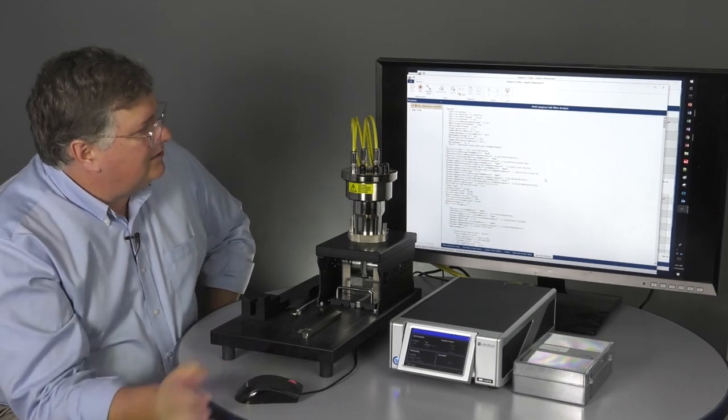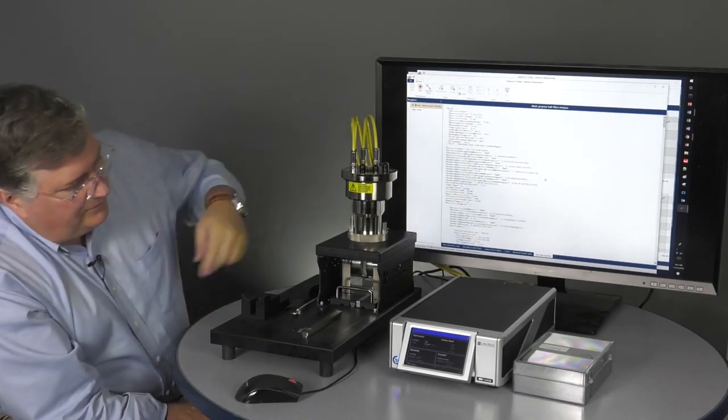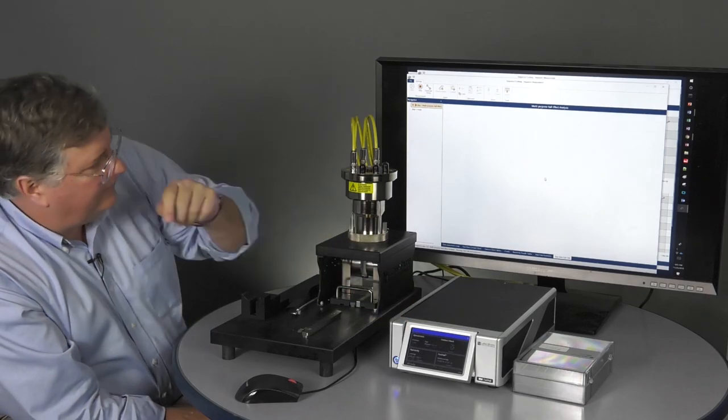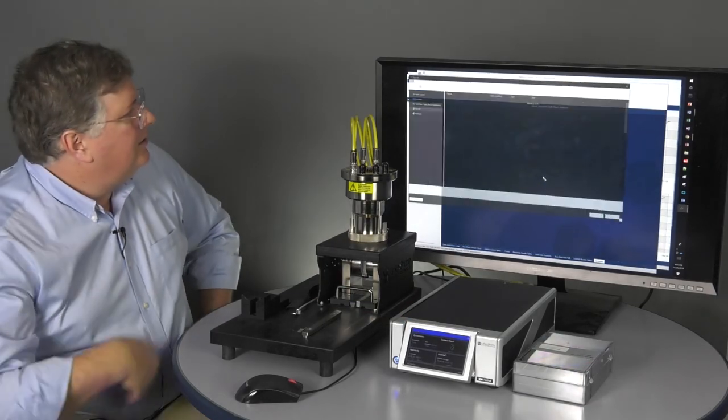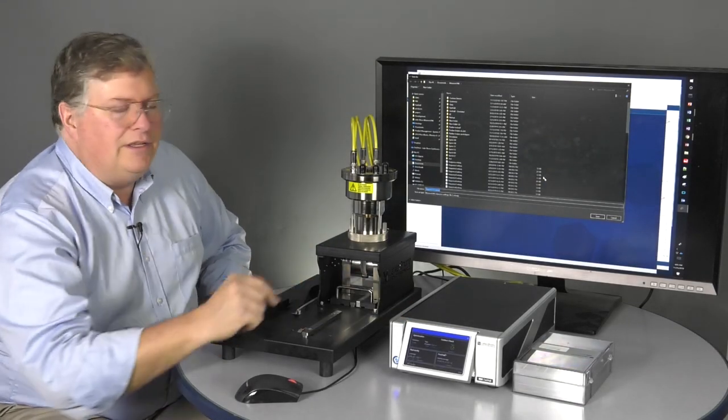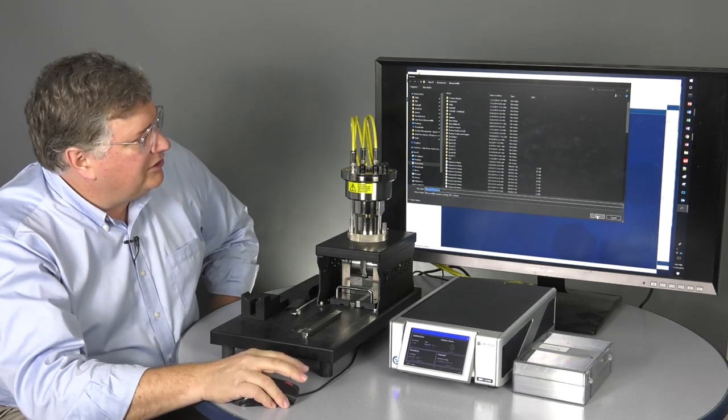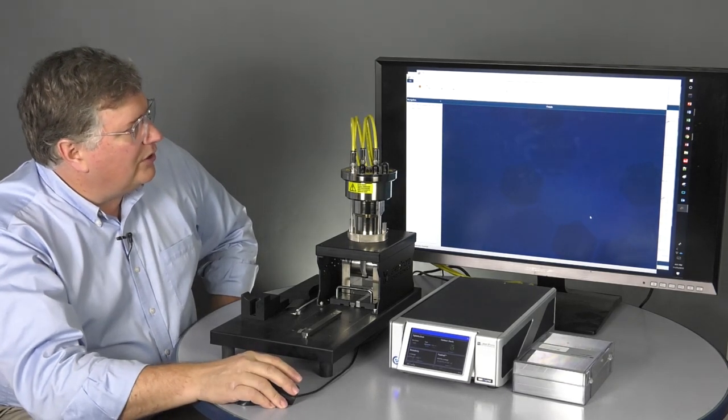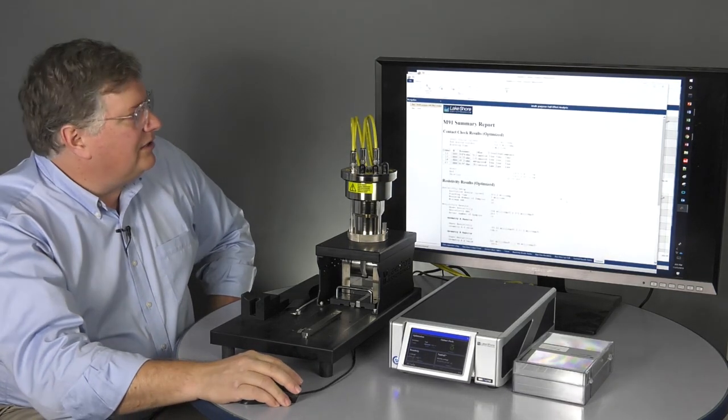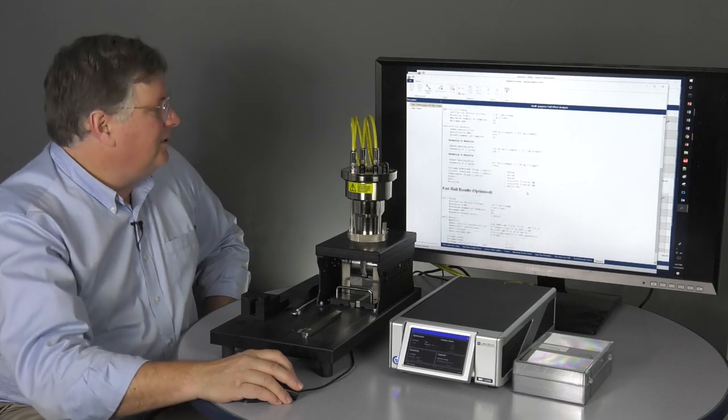I've got my one Tesla, so I'll go ahead and put that in now. And it will finish up by running the fast hall. So also notice how quickly the M91 is making these determinations. This is also a relatively difficult sample.